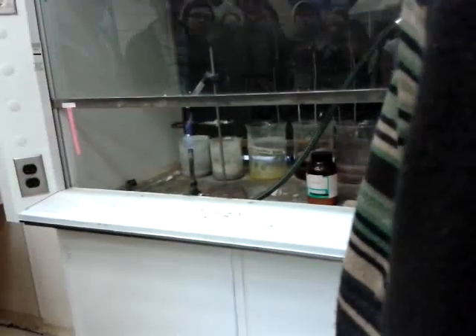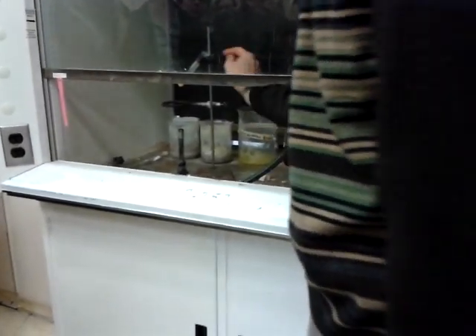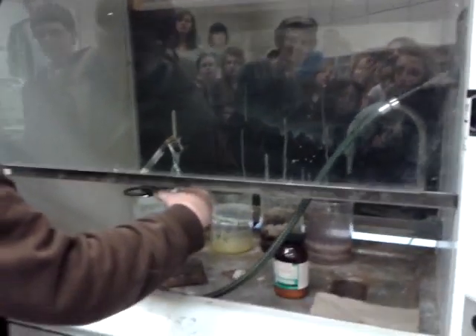I'm just going to warm it up till it melts — only because there was some chalk in there. Now you're going to put your hand in there and get your hand out when the time comes. It might be too big; give it a little push if you have to.